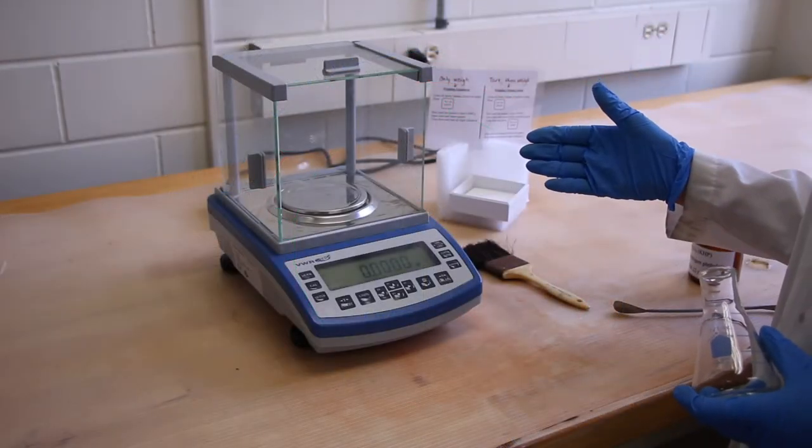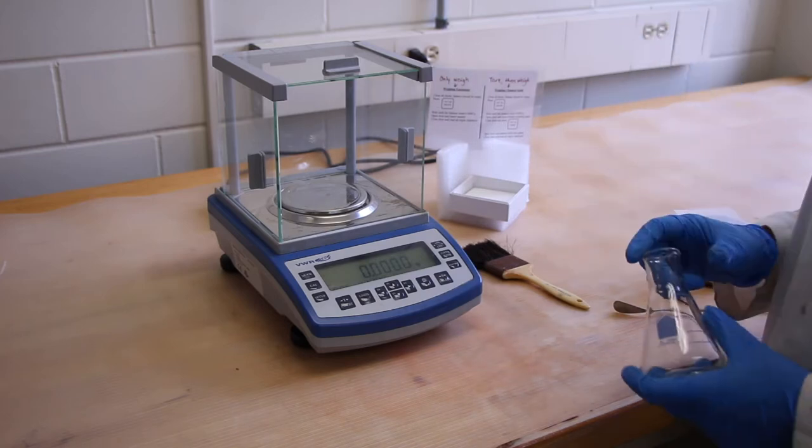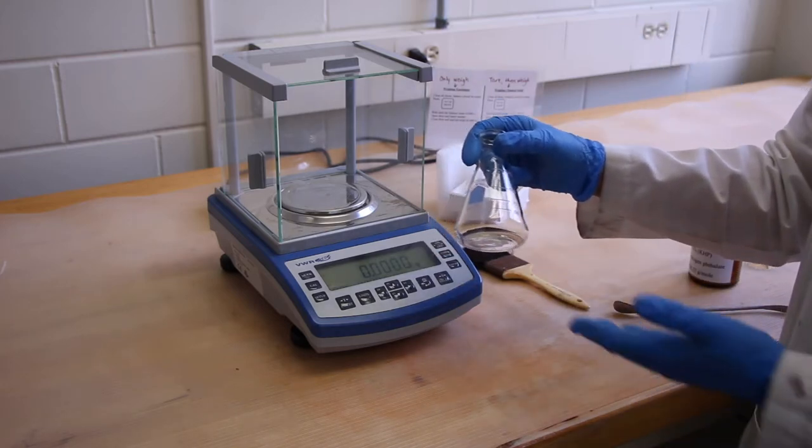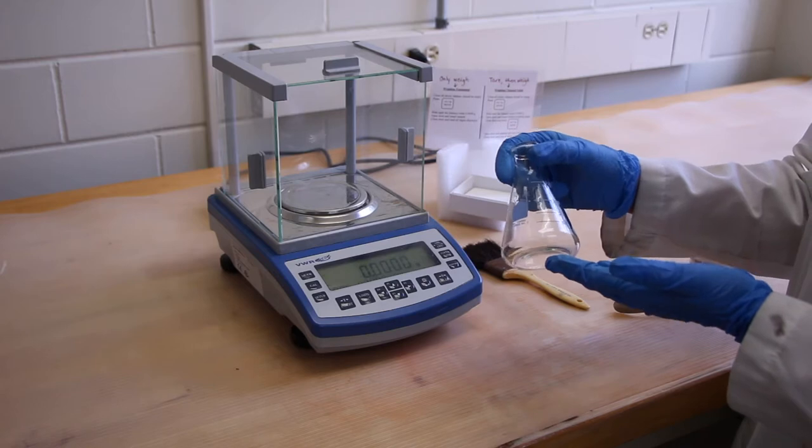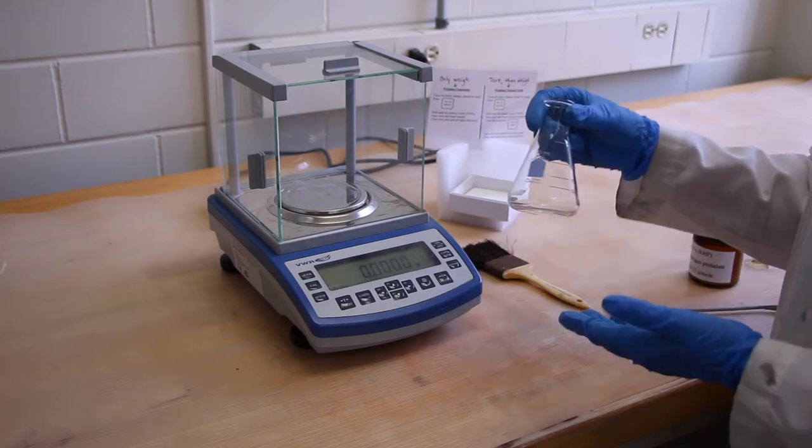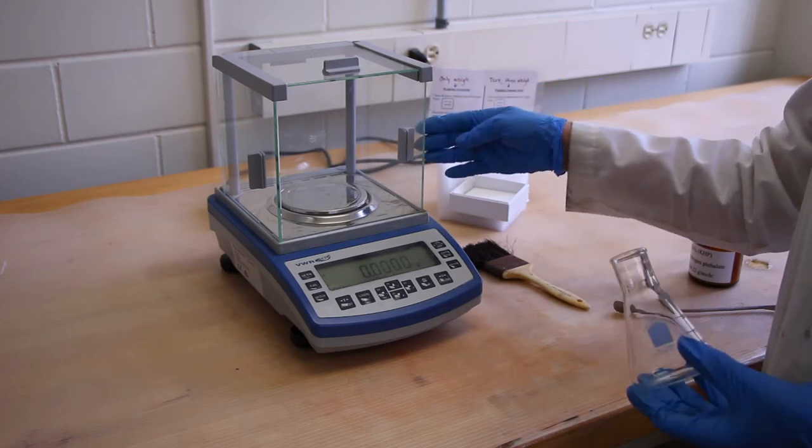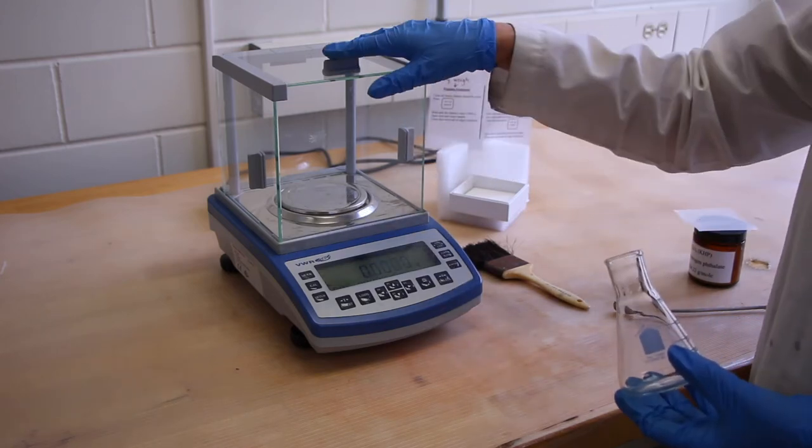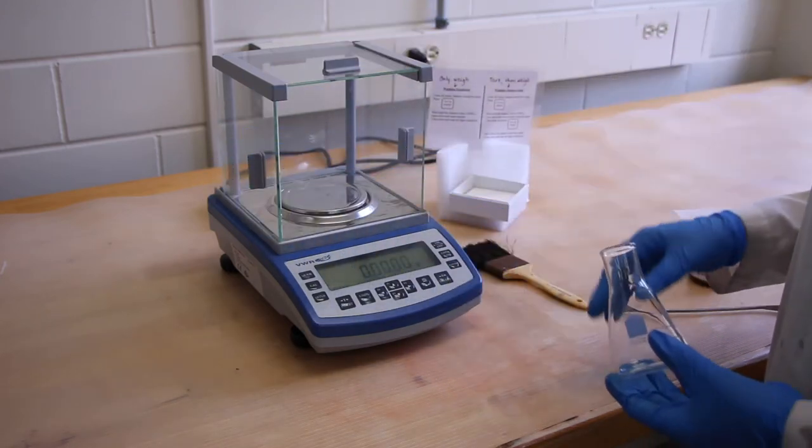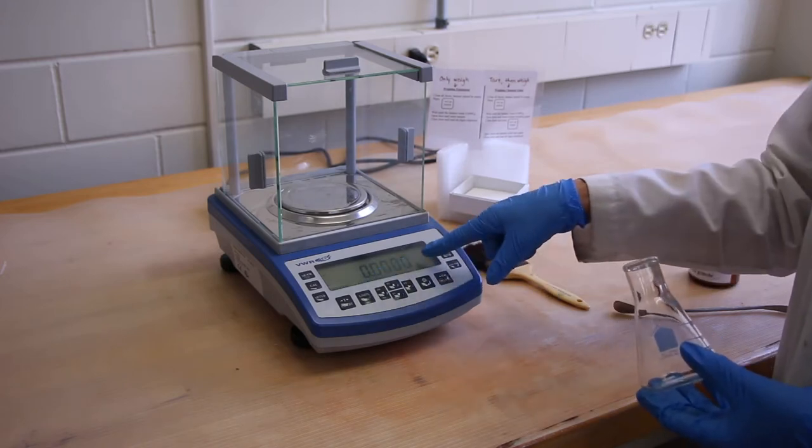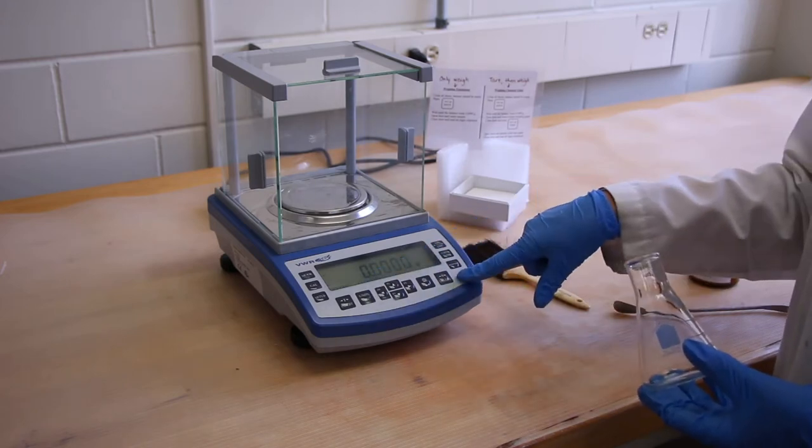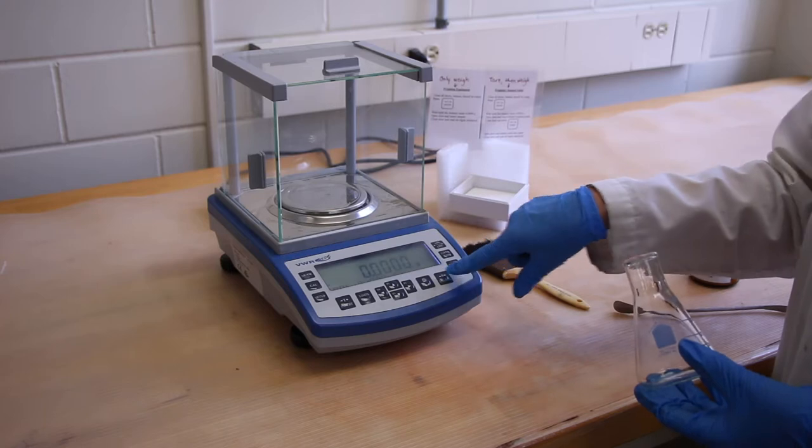We're in the balance room now. We're going to do two different kinds of weighings. The first is sometimes you just want the mass of a piece of equipment. And what we'll do first is we will shut all the doors of the balance, make sure that they're shut, and make sure the scale reads zero. If it does not, you can press the zero button.